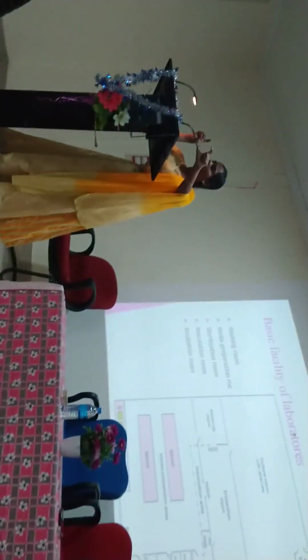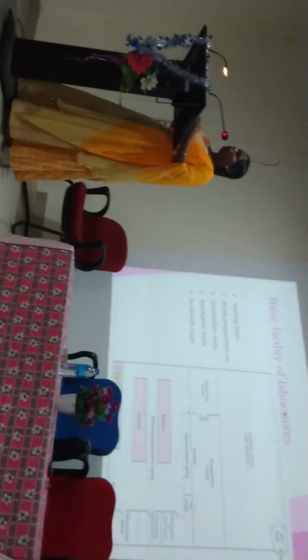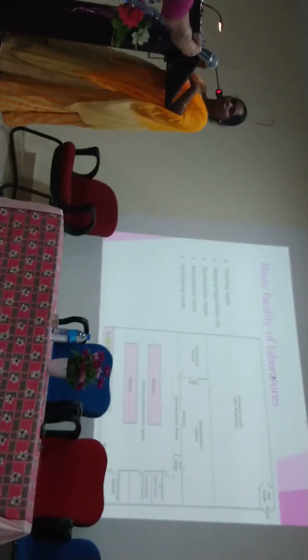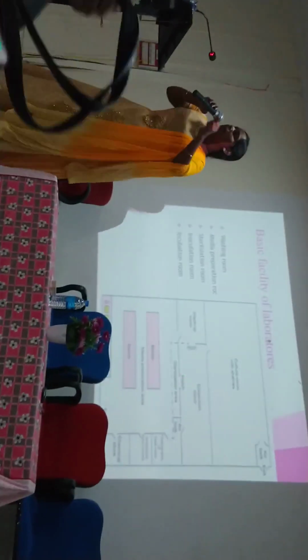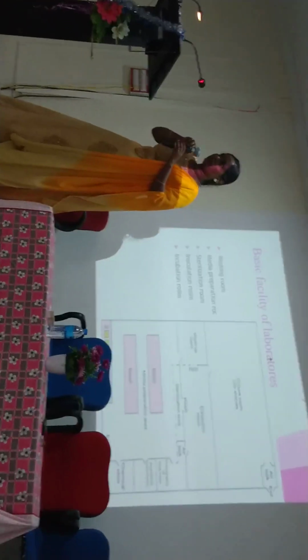Different chemicals are used in order to prepare the micronutrients. I will show that in the next slide. Okay, so for the media preparation, we won't add all the chemicals at a time and mix them up. So what will happen? It won't get dissolved.